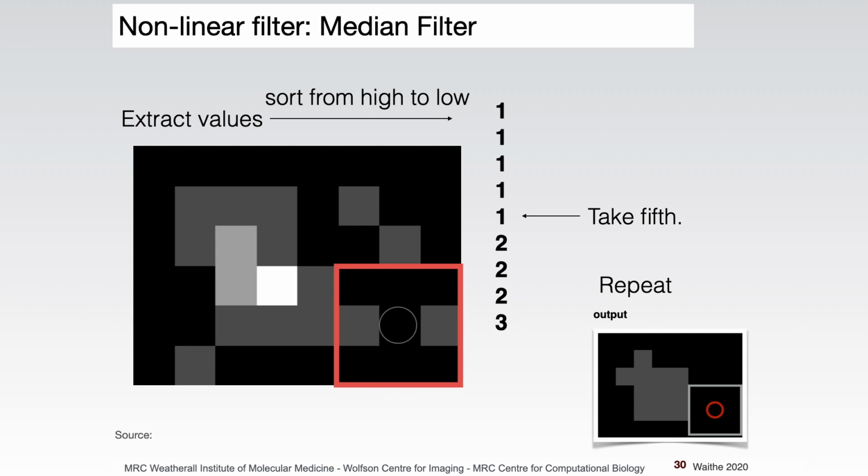And all of these are fine. There's no right or wrong way. It depends what you want to do. I have forgotten right now how Fiji does it, but it probably just reflects the image, or it might do a 0. I think it actually does a 0 when I think about it. But what you can do is filter an image, then zoom in on that edge in the output and see what it says. But it definitely doesn't make the image smaller, which is actually my preferred thing to do in Python.